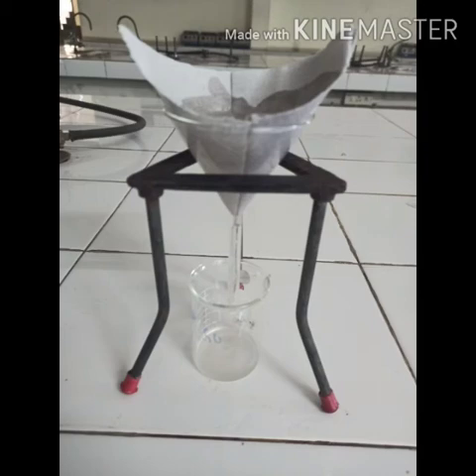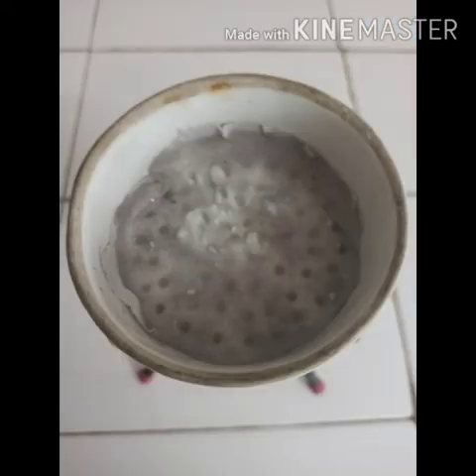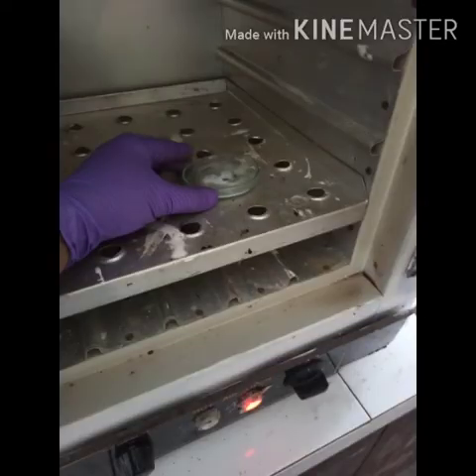The resulting reaction mixture was then filtered and the solution was kept in the refrigerator overnight. After that, the solid which was filtered was washed with cold water and dried at 100 degrees Celsius for 2 hours.